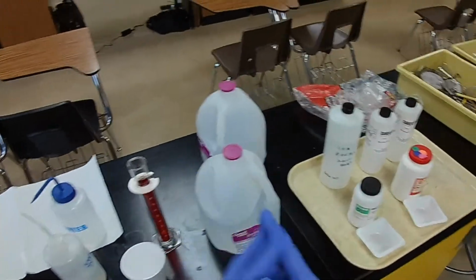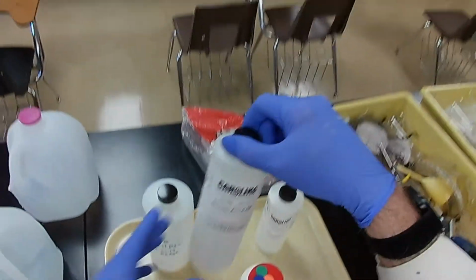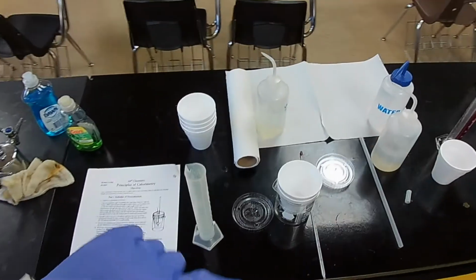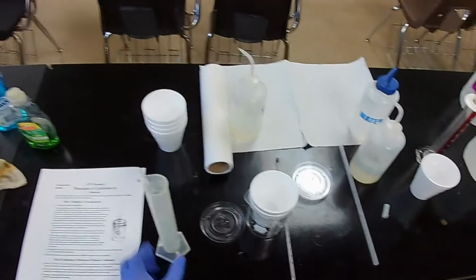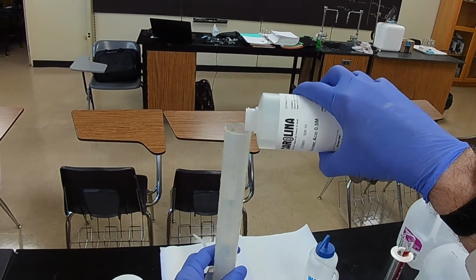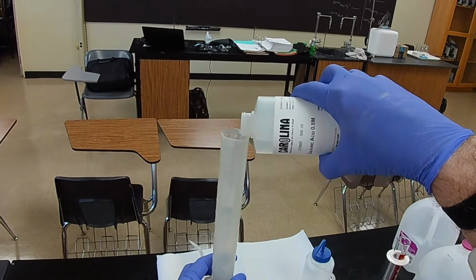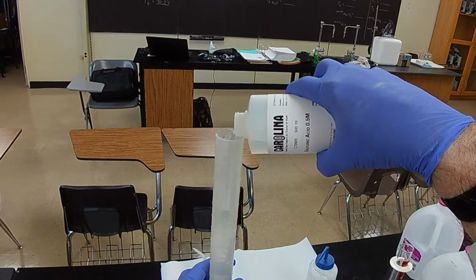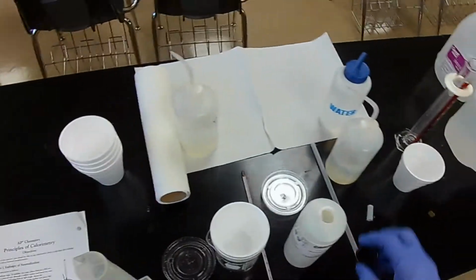All right. So here's our sulfuric acid, 0.5 molar, and we need 60 milliliters of that. All right. So here we go. 60 milliliters of sulfuric acid, 0.5 molar. There's 50. Okay, I think I went over.